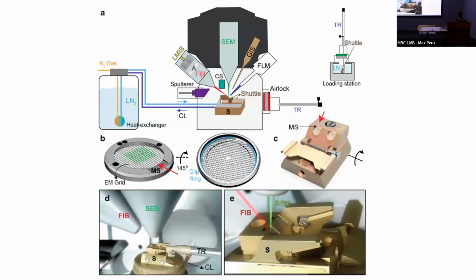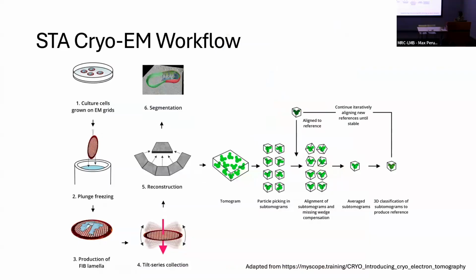There's a technique called sub-tomogram averaging. When you're doing this section, it's just like your light microscope.